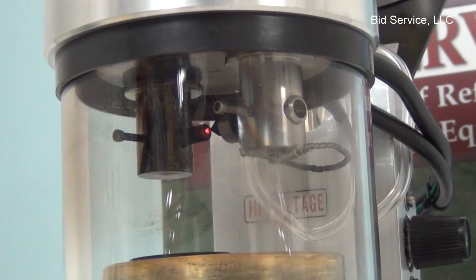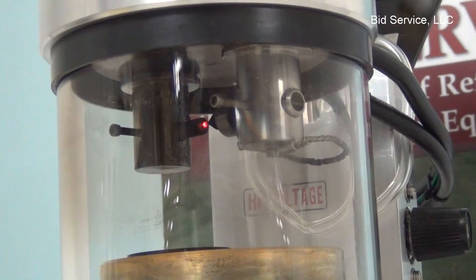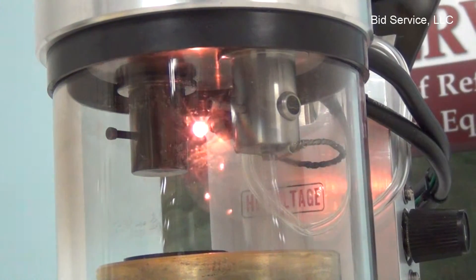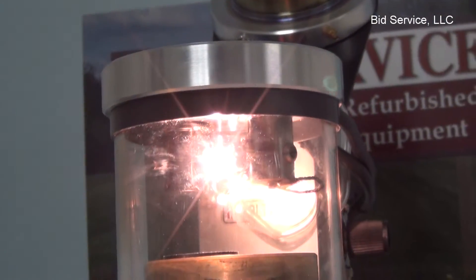Now that we've heated up the carbon rod, I'm going to increase the current until we get to a point where it will start depositing.